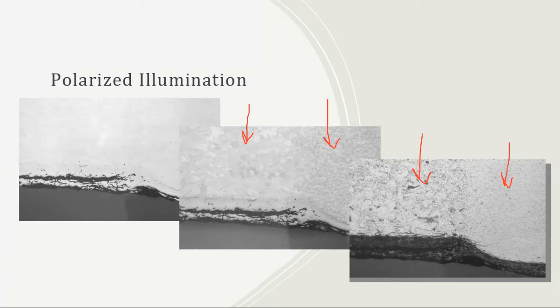Another reason is because you're looking at this dark casing or whatever this was on that outer surface. In polarized light, it still remains. So you could still see how it interacts, versus the etchant burning it to where now you would not be able to do any type of microscopy.